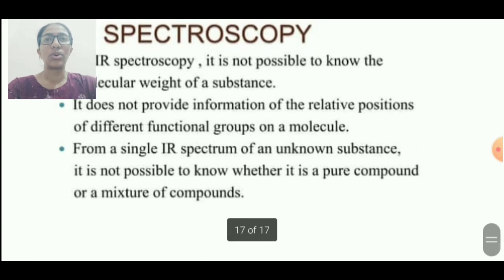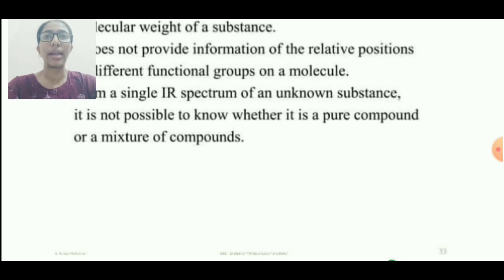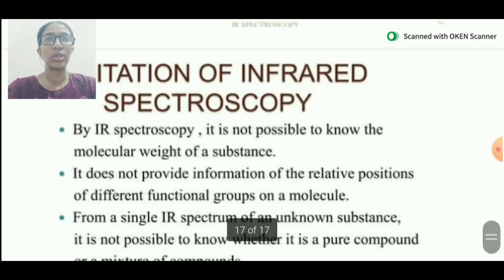So that was all about IR spectroscopy, where we have discussed its applications, factors, some terms, fingerprint regions, the stretching and the vibration, then its types, stretching, bending, then further their types, and the introduction, also the principles.